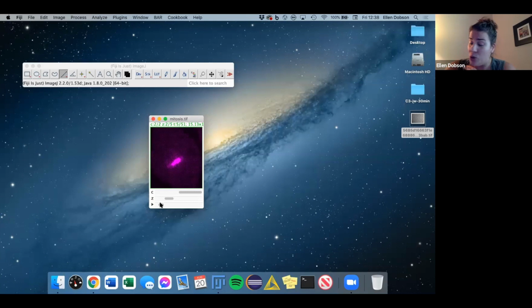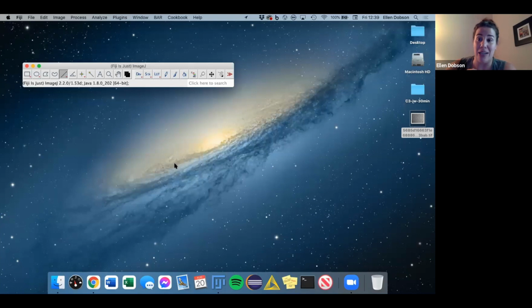One of those tools is called Big Data Viewer. I'm not going to go over Big Data Viewer today, just because it's a beast of a plugin. It's amazing. It's tough getting into it, but once you're in it, it's a fantastic tool. So I recommend anybody who's working with higher dimensionality data sets to look at the Big Data Viewer.